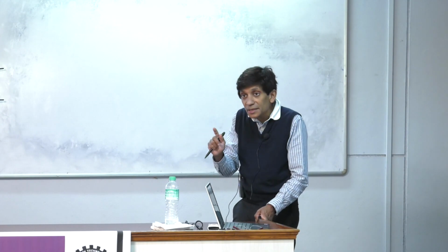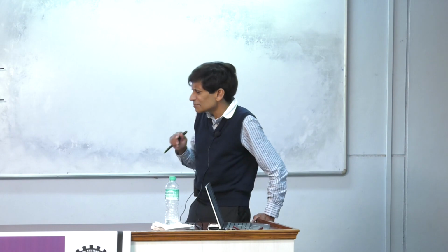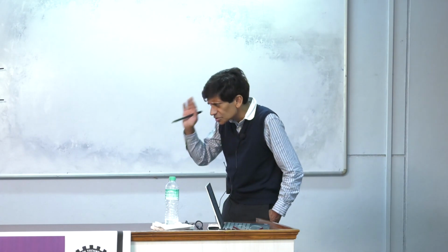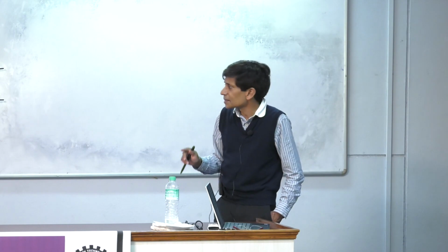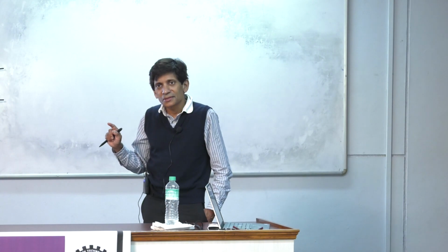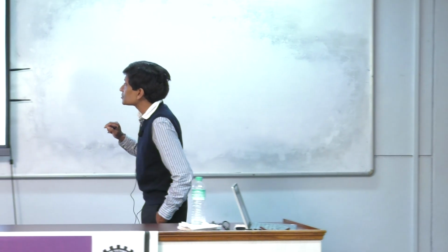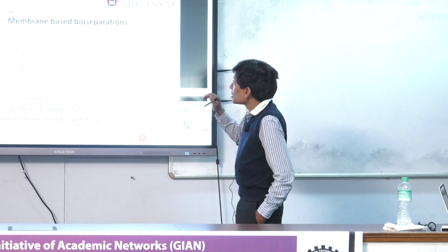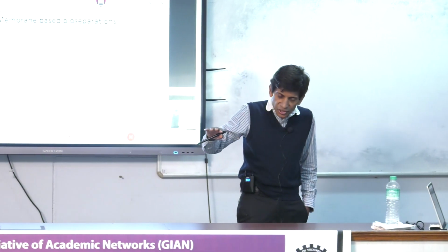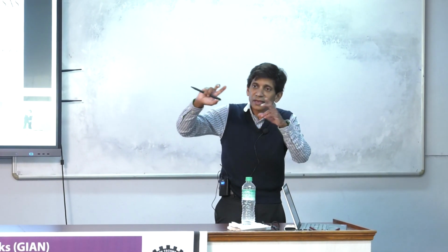Yes. We will talk a little bit about protein separation that you mentioned tomorrow, okay? But that's a developing method. But today, ultrafiltration is used for protein concentration and buffer exchange. Okay, so that's those two. What's virus filtration trying to do? Remove viruses, contaminating virus particles. So I had mentioned that virus filtration membranes consist of a microfiltration support with an ultrafiltration layer on top, okay? The other thing is they run in reverse asymmetric mode, okay?